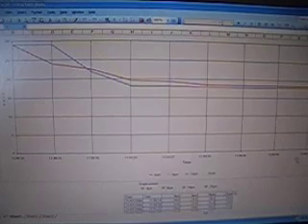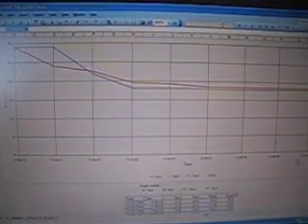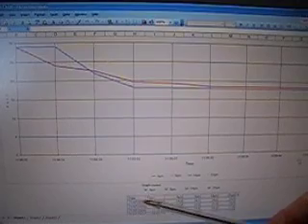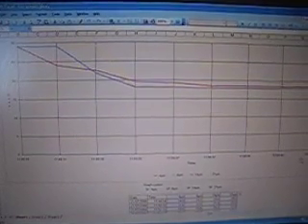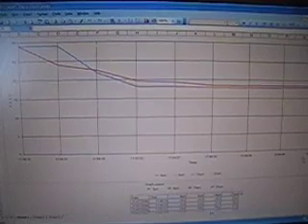The traceability aspect of this is vital in the sense that we can build up complete traceability of today's date, today's time, and all the cleanliness codes that are required to produce a quality report.